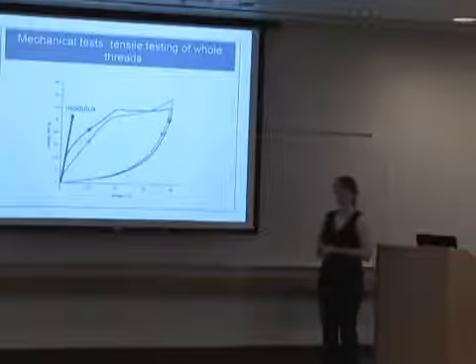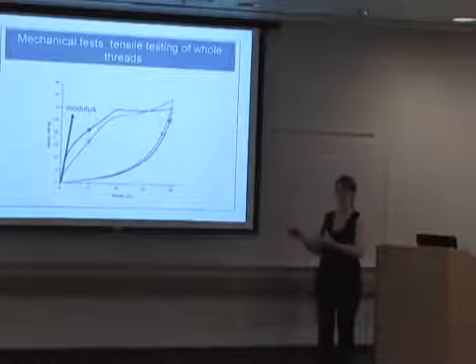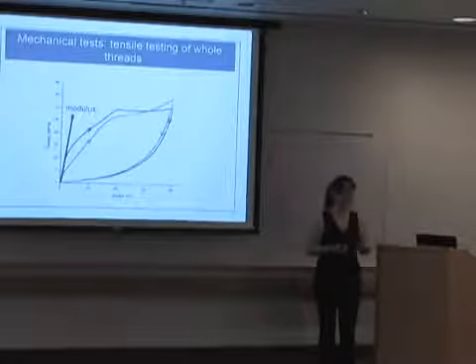Another important thing that I can get from these graphs is the modulus of the material. The modulus is stress divided by strain. So for this graph, it's simply the slope of the initial linear portion of the graph. And it's considered to be a measure of stiffness of the material.